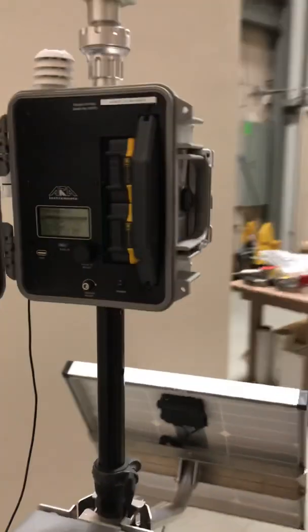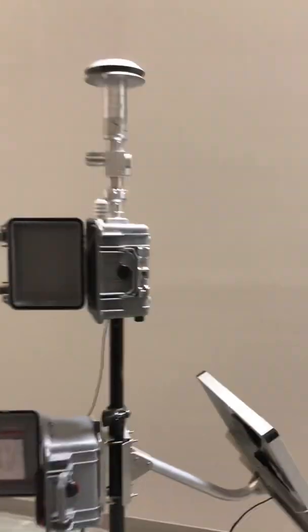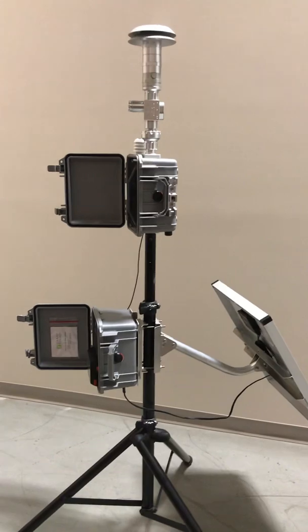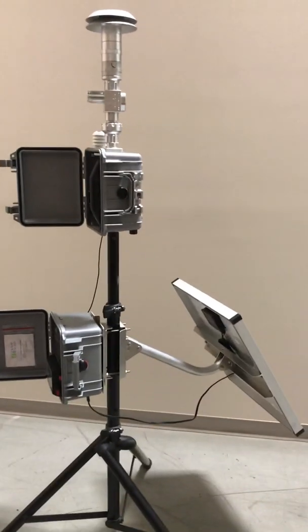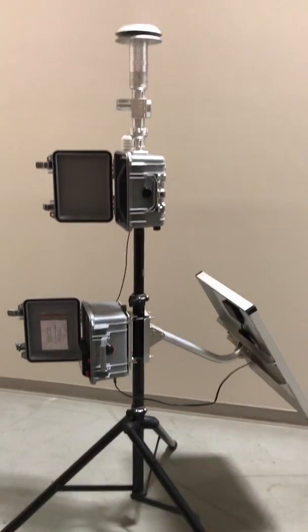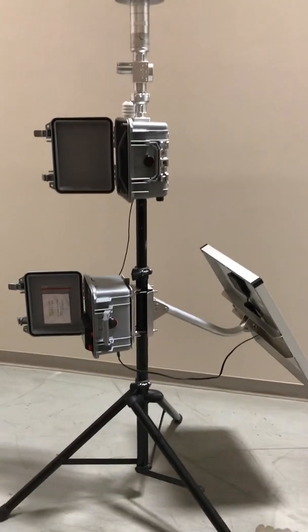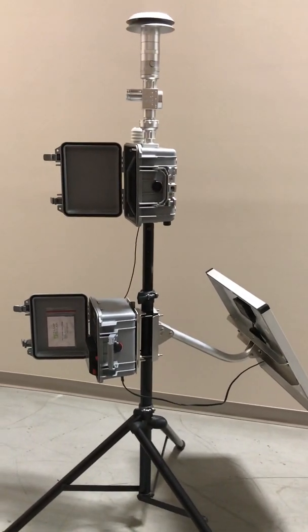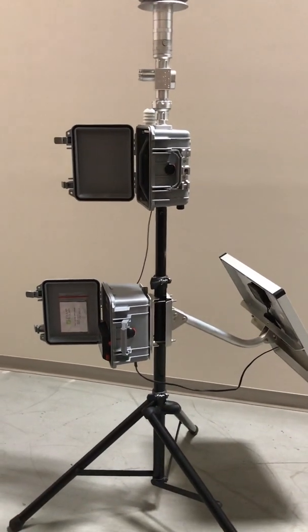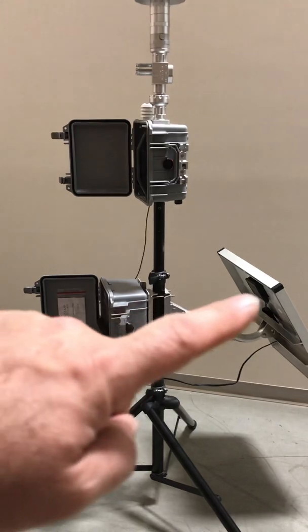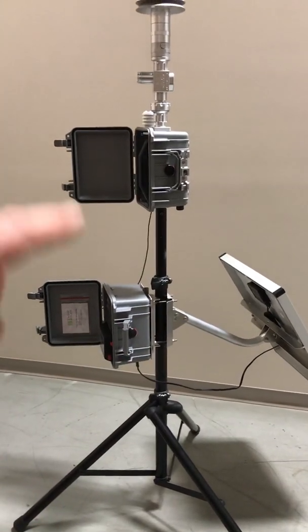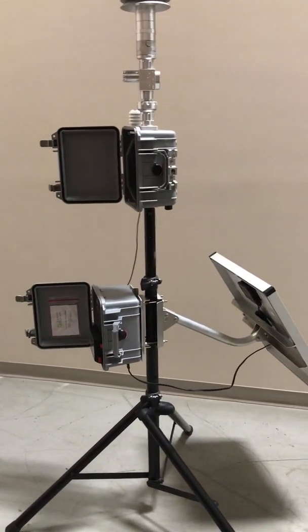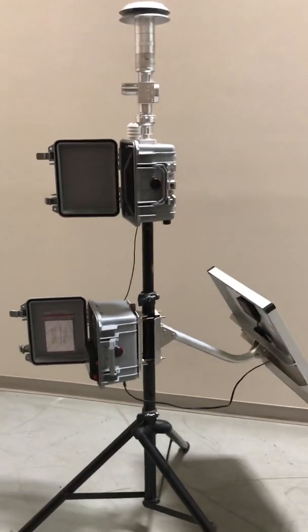So this again is the ARA Instruments portable particulate monitor, used to collect particulate matter onto a 47 millimeter filter. You can see we have the tripod mount, solar panel, and to the left we have the power pack right here. The solar panel feeds the power supply and then up through this cable into the particulate sampler module. It's a very simple unit.